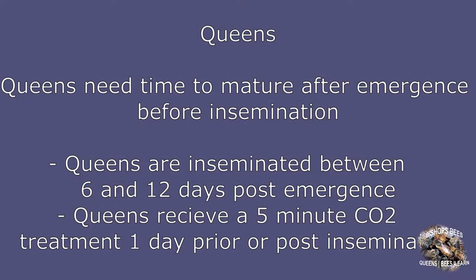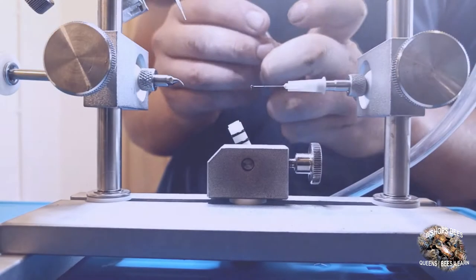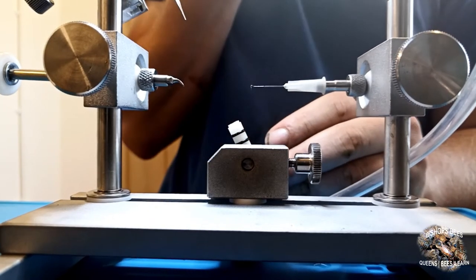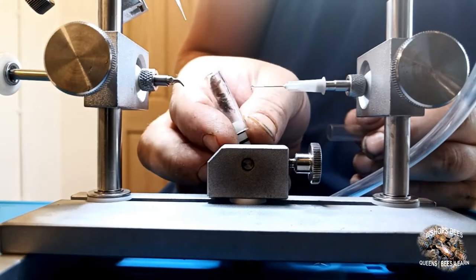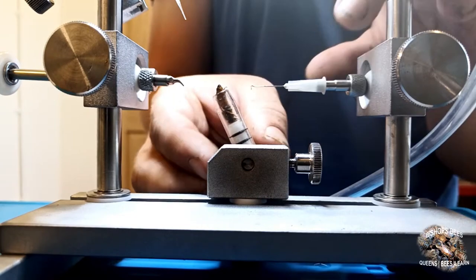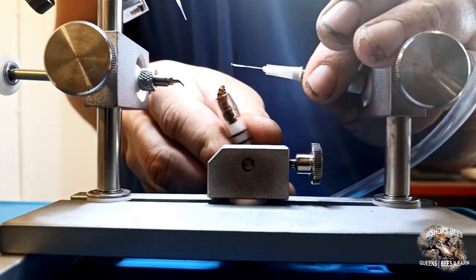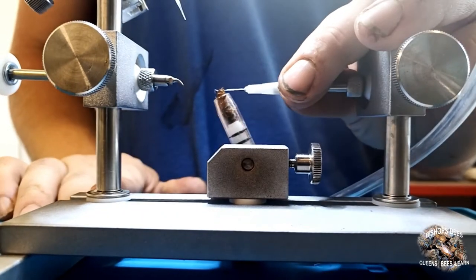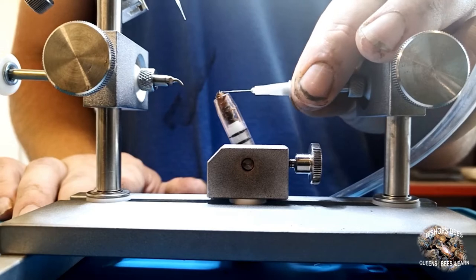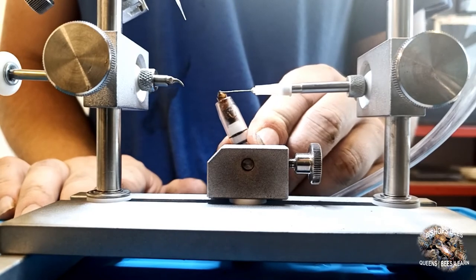Queens need to mature before insemination and will require 6 to 12 days post emergence. The mature queens are encouraged into a tube called a backup tube, which is then placed against the queen holder and the queen is encouraged to walk backwards into it. The queen holder is then placed over the CO2 applicator. The CO2 will anaesthetise the queen and prevent movement during the insemination process. The queen is positioned dorsal side down in the queen holder and the ventral hook and sting forceps are moved into position.